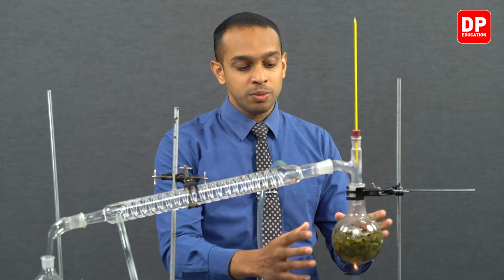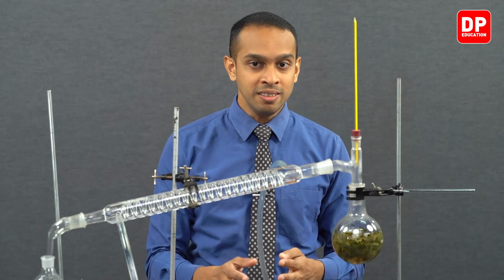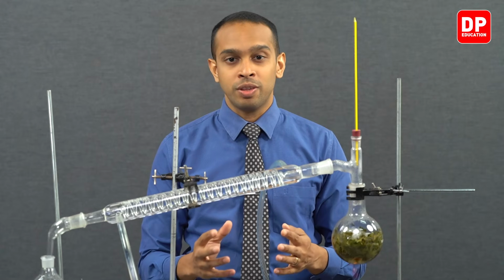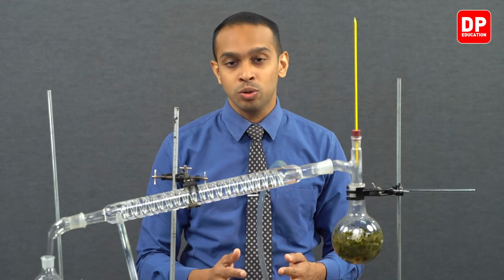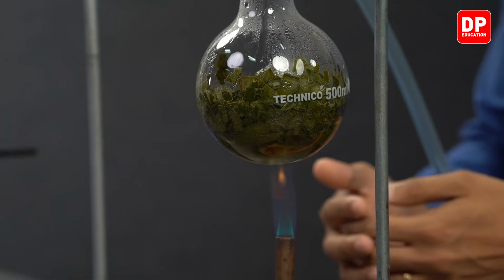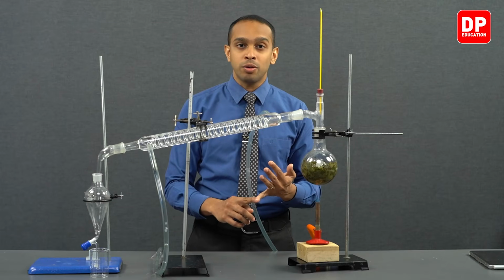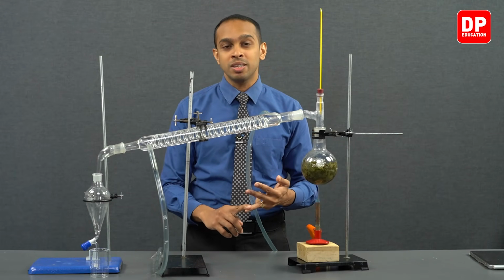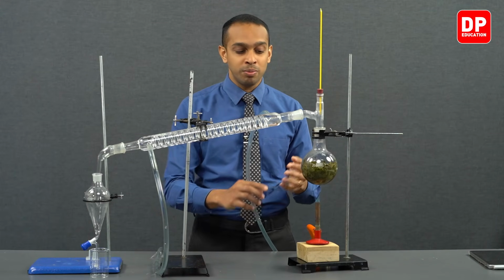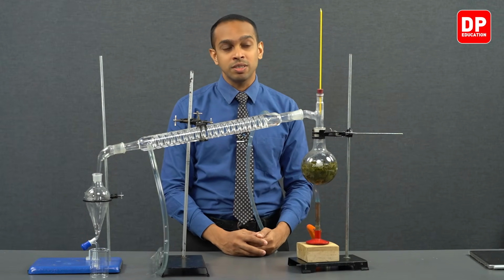So this particular setup will start to boil at a lower temperature than both of their individual components. So the temperature at which this will start to boil is going to be lower than both the boiling temperature of water and the boiling temperature of eugenol, which is the main essential oil seen in cinnamon leaves.